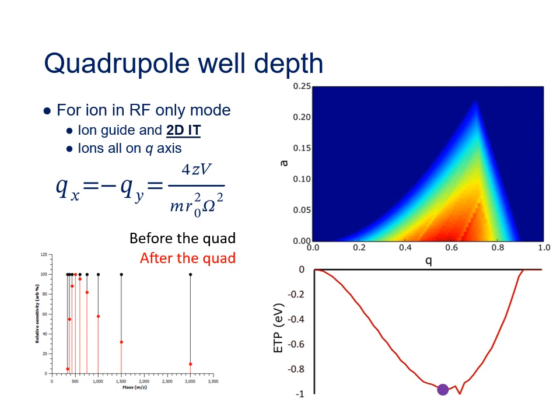But now let's think about the ions that were a lower mass-to-charge ratio, that were originally in this region of the diagram. So let's see what happens to this lower mass-to-charge ratio ion as we move this heavier mass-to-charge ratio ion down to the bottom of the trapping well. As we increase the RF amplitude, the Q of both ions will increase by the same amount.